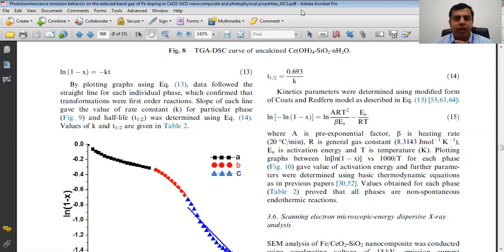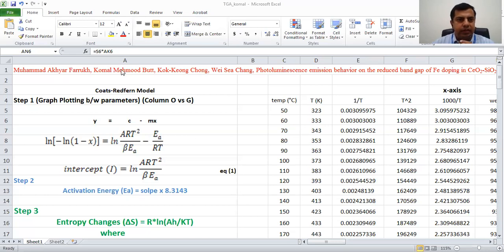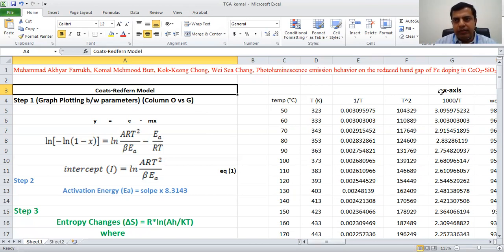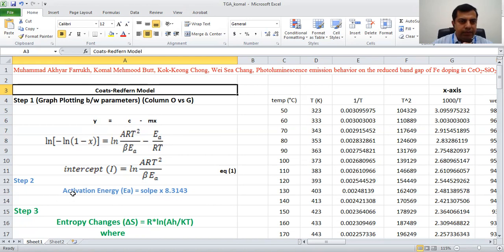Now I will show how to perform all these calculations in Excel to find the kinetic and thermodynamic parameters. Using the Coats-Redfern model, the main equation has Y as the dependent variable, C as the intercept, Ea/R as the slope M, and 1/T as the X-axis. To get the activation energy you multiply R by the slope.